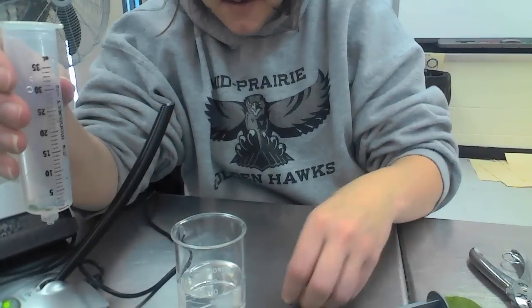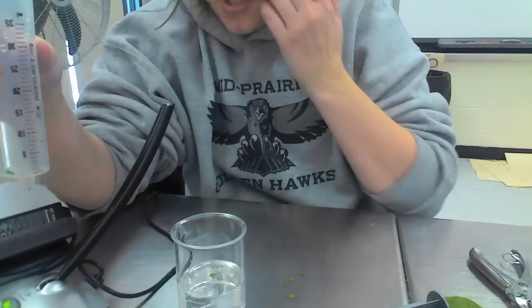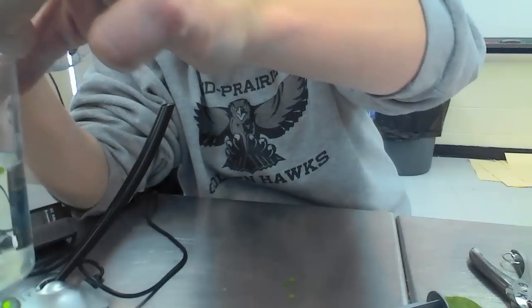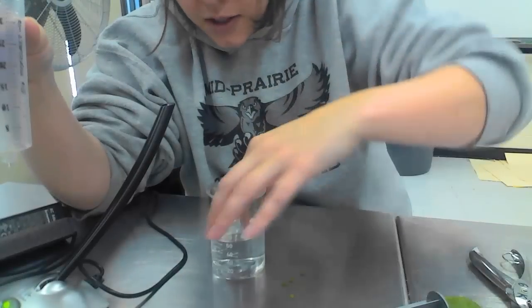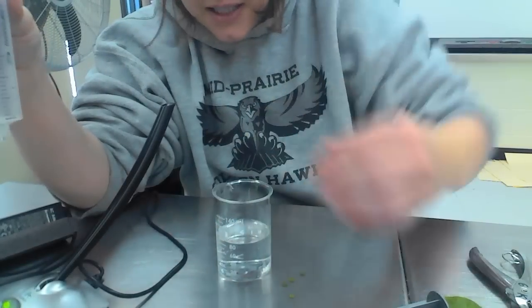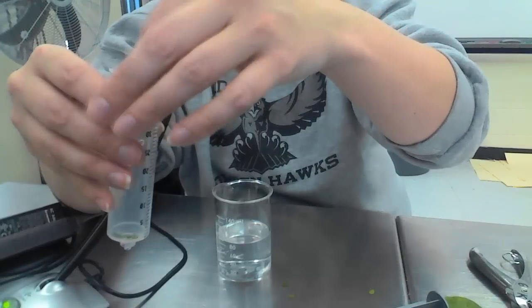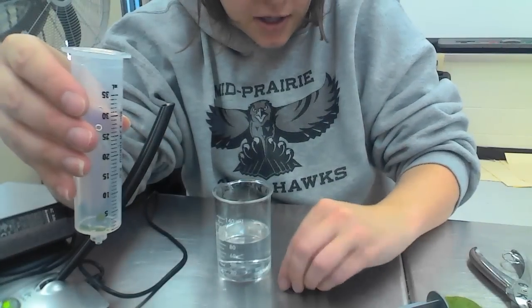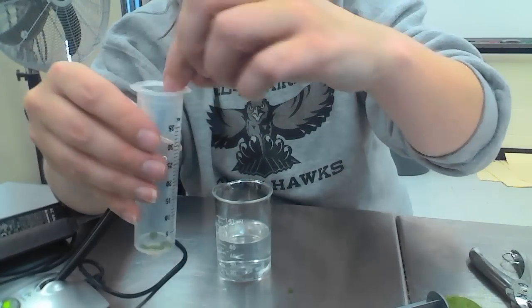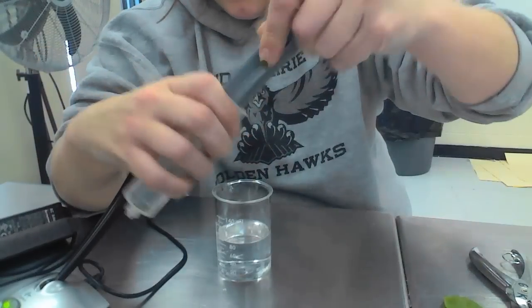And here's the reason why. If I put a chad, a piece of spinach leaf, into the water, you'll notice that it's floating on the top. I don't know if you can see that very well. It's floating on the top. We don't want them to float. We want them to go to the bottom so that we can see photosynthesis actually occur. So we need to get all the air out of our leaves. Leaves actually have air pockets in them, and we need to make sure all the air is out so that they will sink. All right, so I put all of the chads into our syringe.